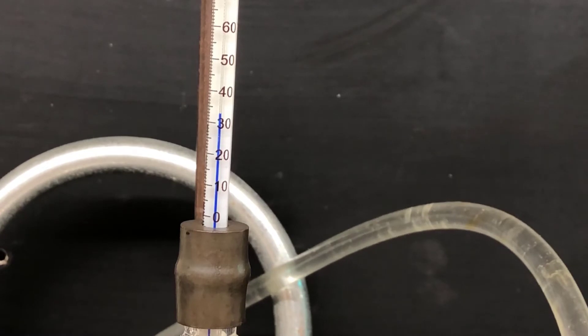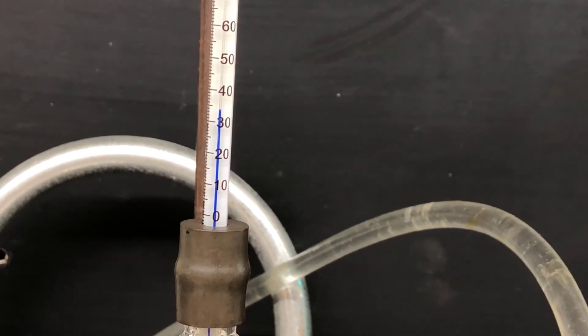It takes a while for the thermometer to reach equilibrium, so be careful not to record the temperature too early. Wait until the distillation is well underway and the thermometer has reached equilibrium, and then record the temperature range of the distilling solvent.